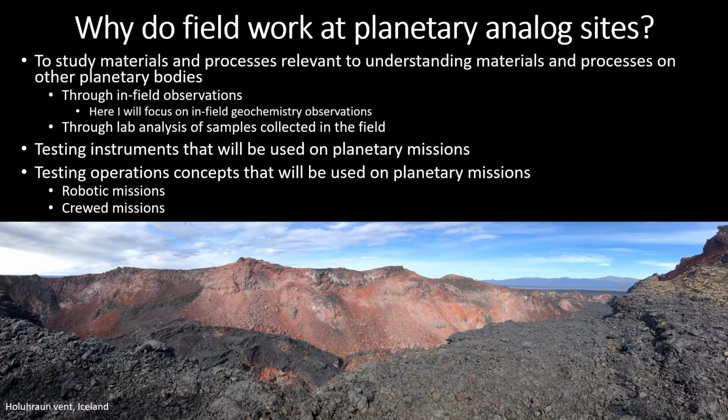And these studies can be done through in-field observations. And for the rest of the talk, I'll focus on in-field geochemistry analyses. But this can also be done through laboratory analyses of samples that are collected in the field. Another reason that we do fieldwork is to test instruments that will be used on planetary missions, or that are like those that are used on planetary missions. And then finally, another reason is to test operations concepts that will be used on planetary missions, both robotic and crewed missions.